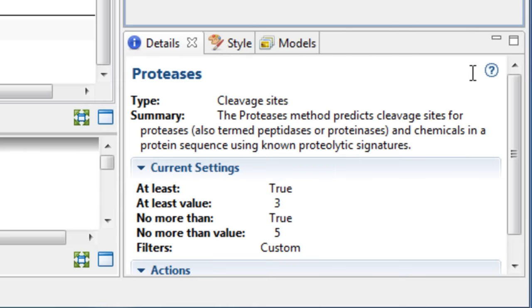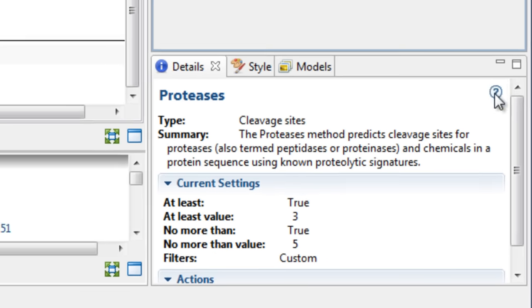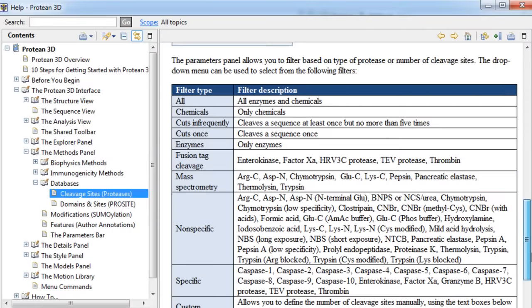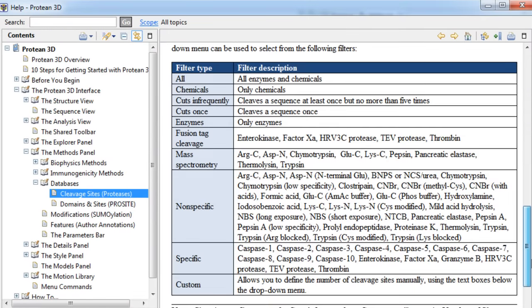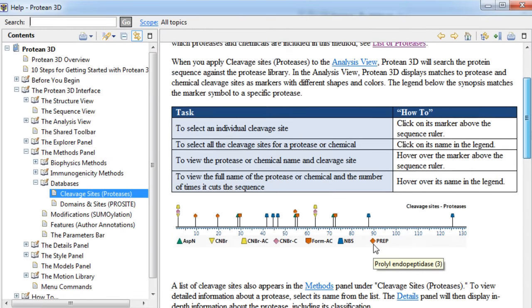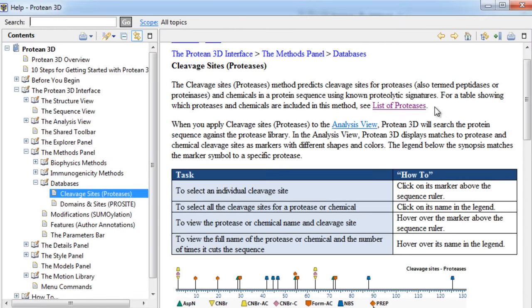To learn more about these different filter types, select the Help icon under the Details panel. Here, you can read descriptions of the various filters, as well as view a complete list of proteases.